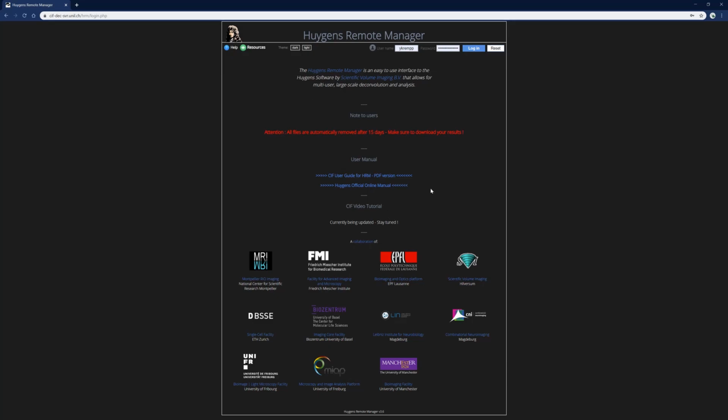Then to go to this portal, you need to go to this web address, which is written here, or you can find the link directly on the CIF website, if you look for the Deconvolution service. Then to log in here, you will need to be a registered CIF user, to have a UNIL account that is member of the CIF group.